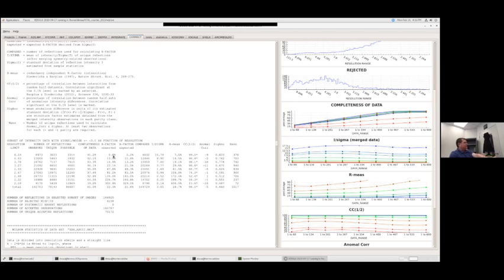Here we got a good 5.8%. And then I'm also looking at the overall R factor of 22%. And usually I'm looking for something 25% or below for a good data set. I might push it a little bit if I'm really trying to squeeze out data. But I know if I'm going above 25% overall R factor, now we're starting to, the data might not be as good as it should be.